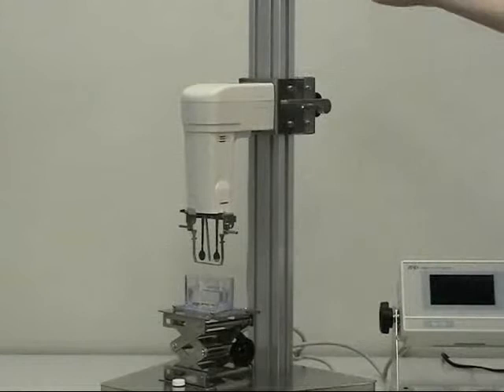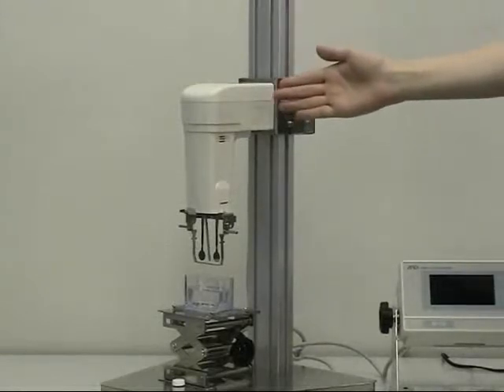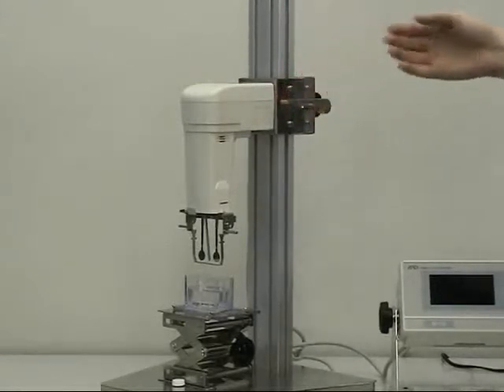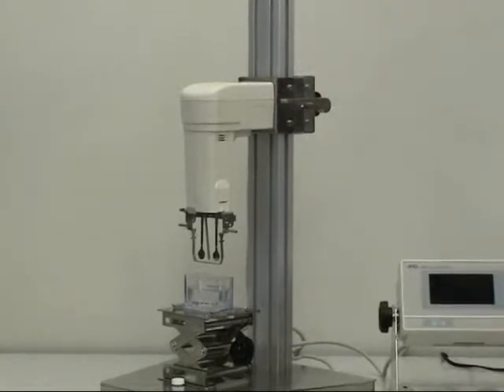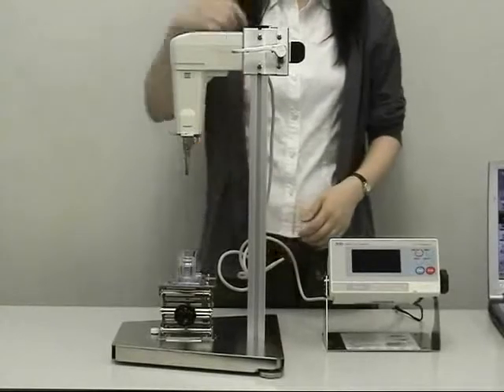The main unit has a stand. The sensor unit is fitted to the stand. The position of the sensor unit is adjustable.